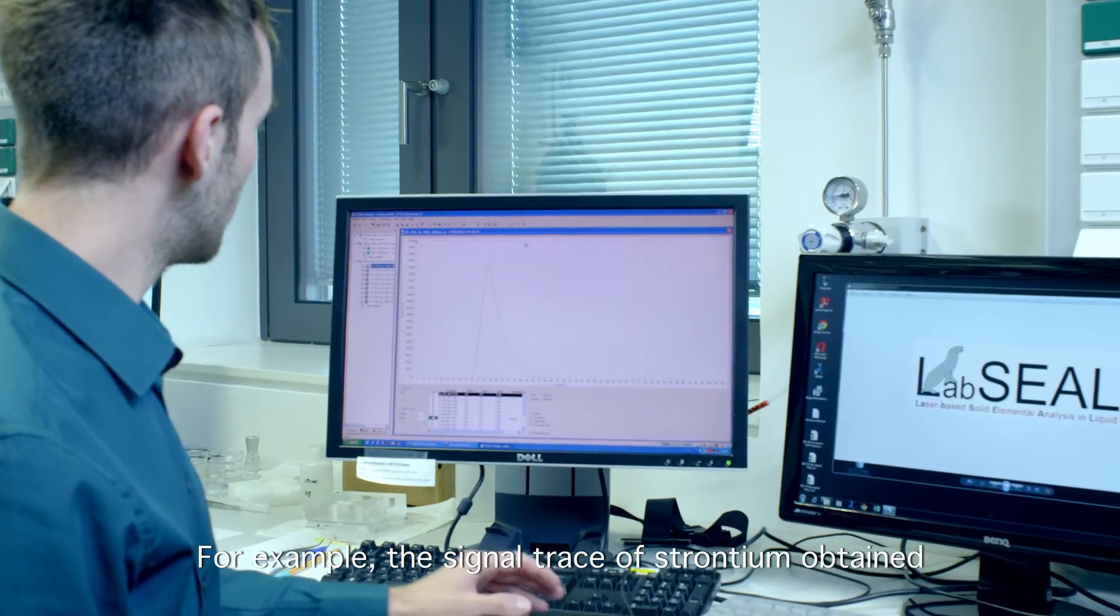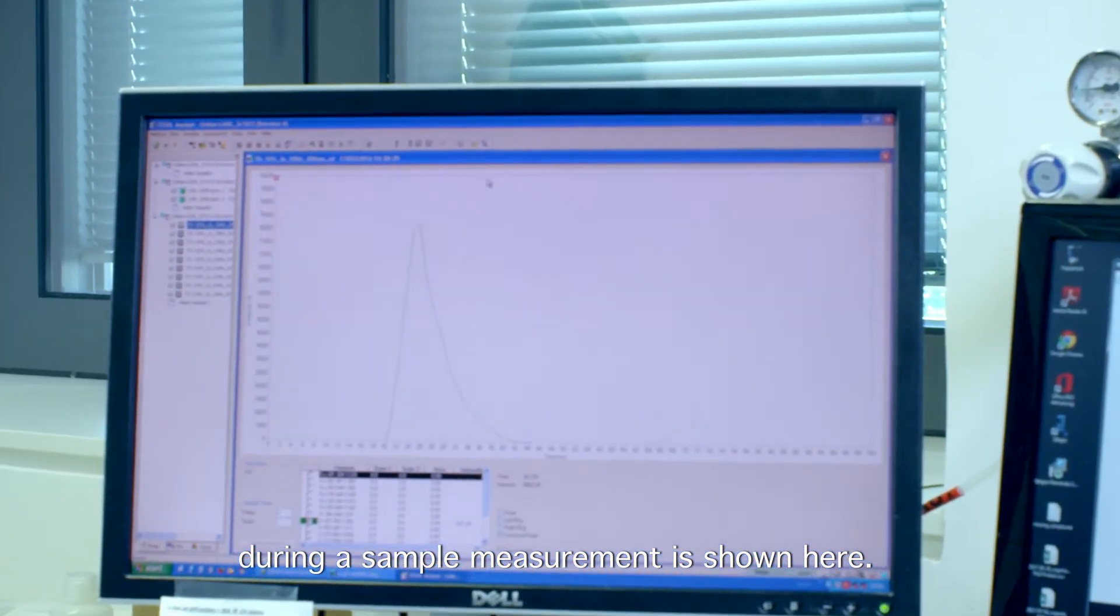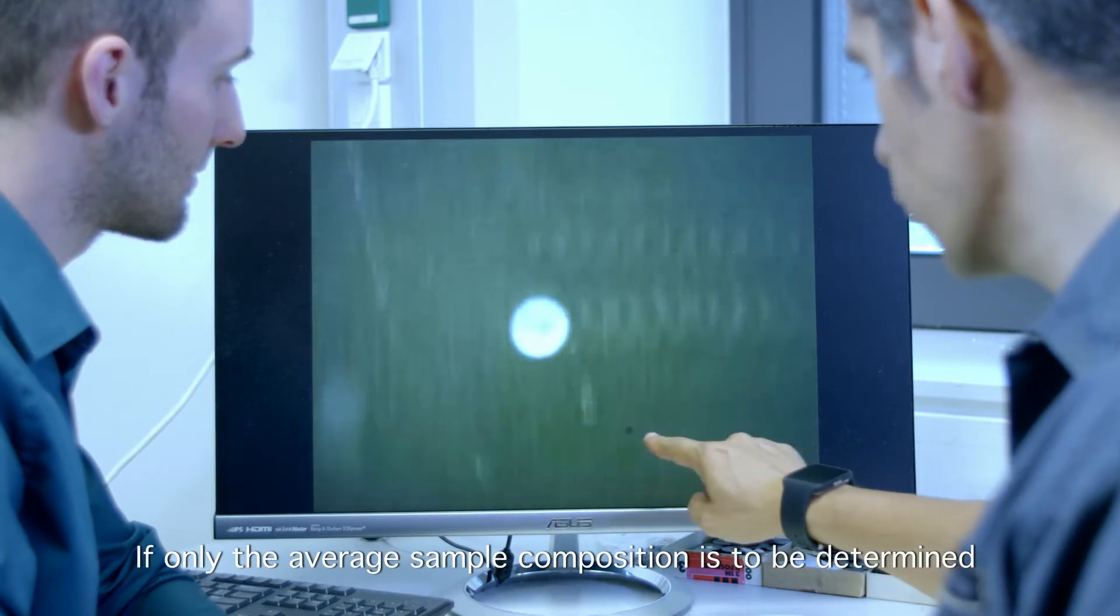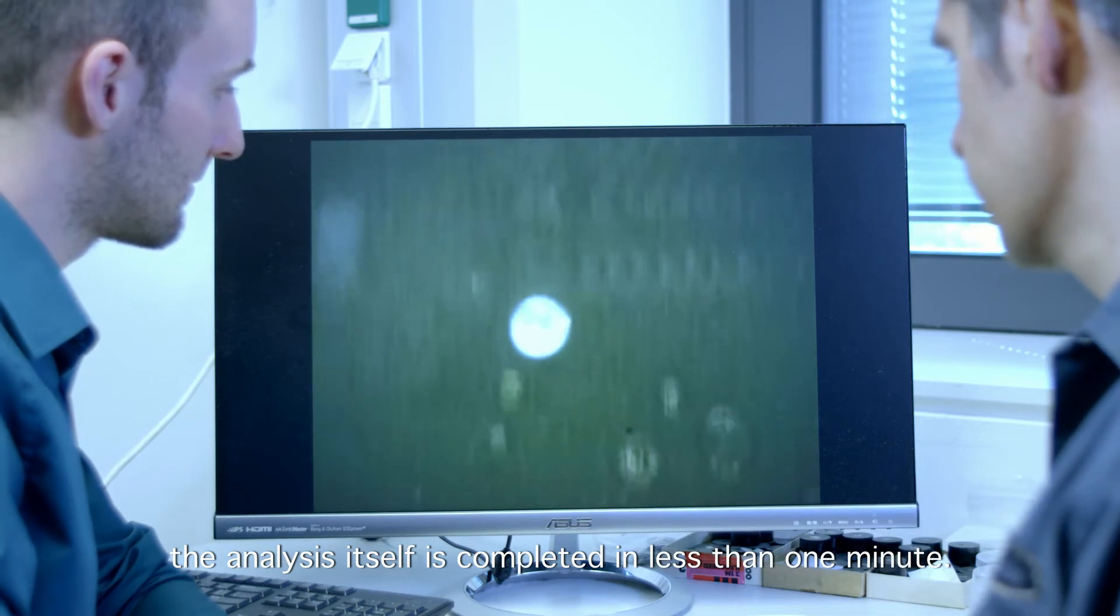For example, the signal trace of strontium obtained during a sample measurement is shown here. If only the average sample composition is to be determined, the analysis itself is completed in less than one minute.